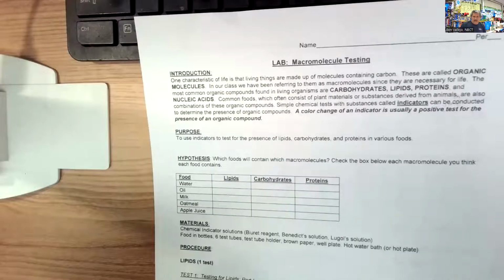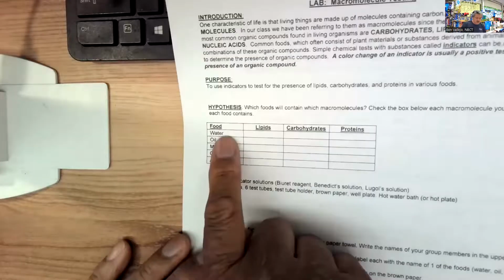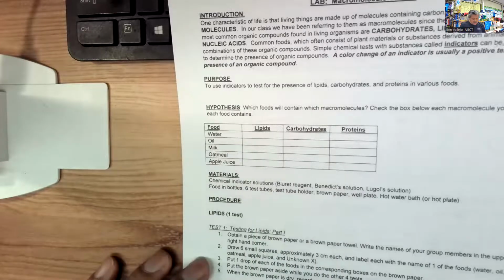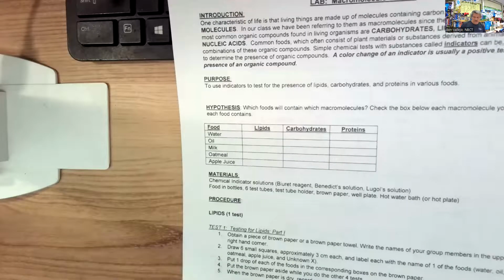You also have the opportunity to make a hypothesis, because what we're going to do is test water, oil, milk, oatmeal, juice, and today it's orange juice instead of apple juice. But we're going to test those 5 foods and then also test for an unknown a little bit later.